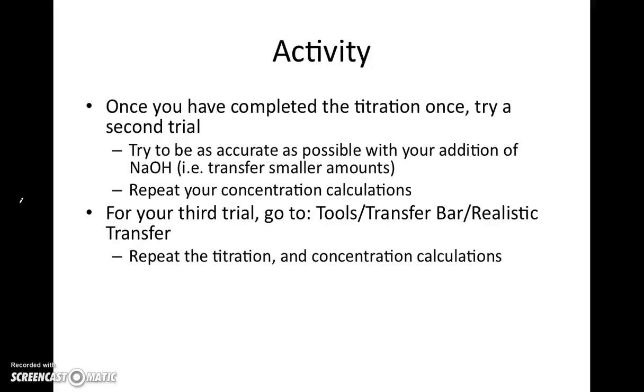Then do a third trial in realistic transfer. So go into Tools, Transfer Bar, Realistic Transfer, and repeat all those steps. It's just a different mode. It gives you more of an idea of what it's going to be like in the real world, actually using a burette, actually doing things.